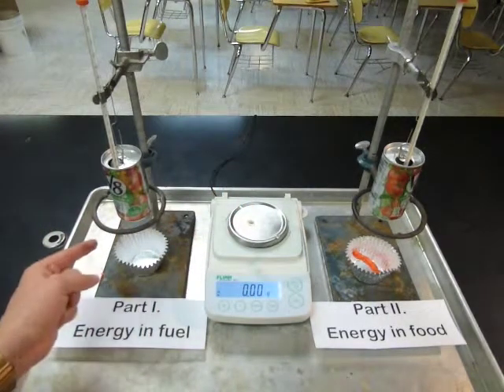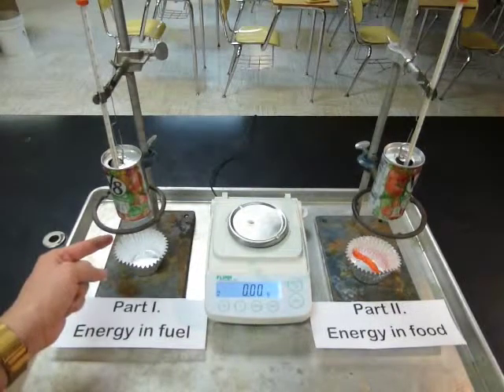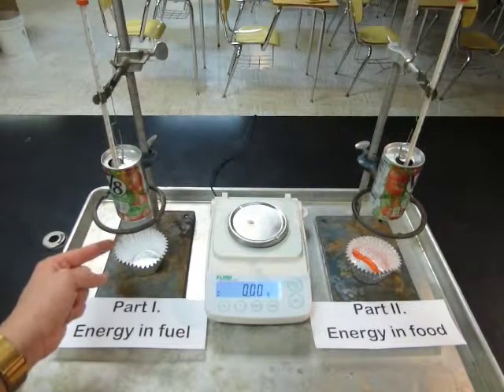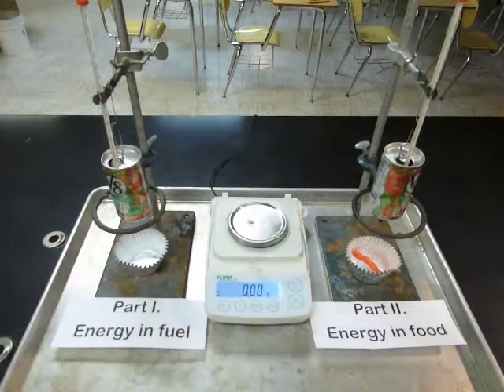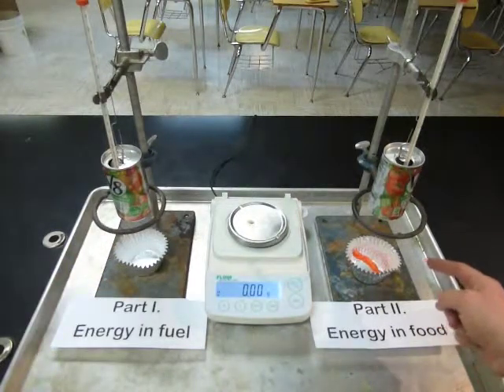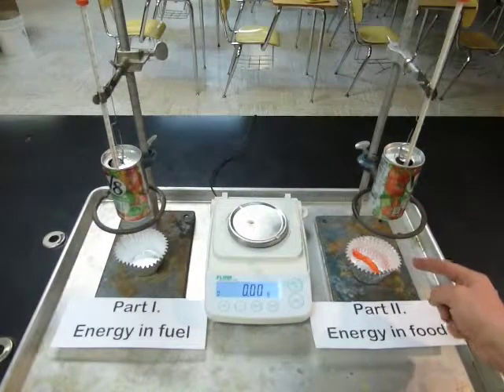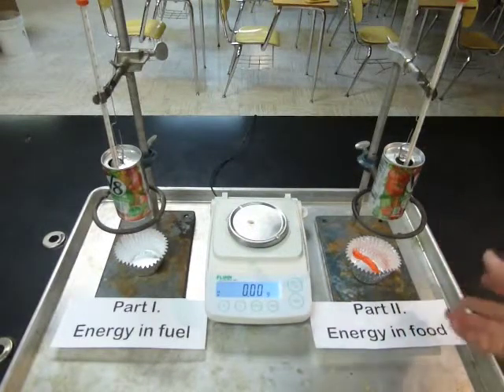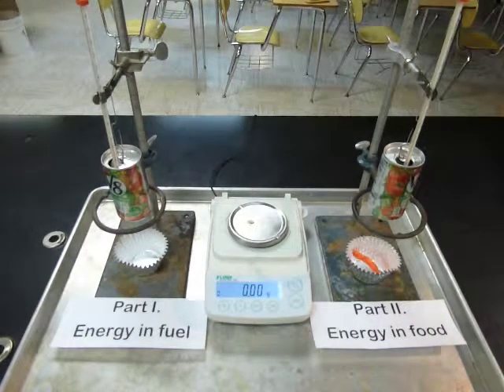But if we know the result that we should get for paraffin, it's a known quantity, then we can calculate how inaccurate our results are, and we can use them to devise a correction factor. So that in the second part of the experiment, when we do the same procedures using a piece of food, in this case a Flamin' Hot, then we can apply that correction factor to hopefully take away the source of inaccuracy. So, looking at the procedures.